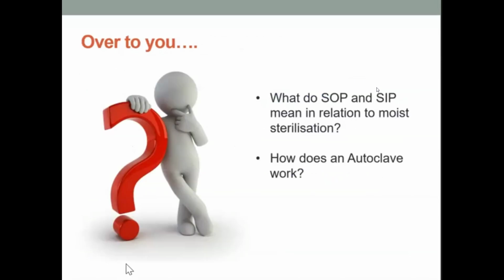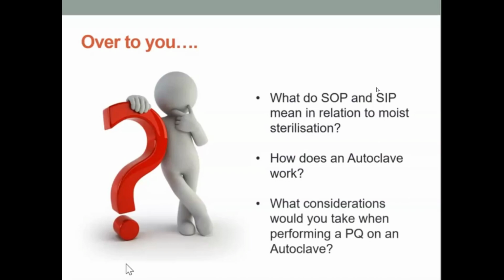Over to you. What do SOP and SIP mean in relation to moist sterilization? How does an autoclave work? What considerations would you take when performing a PQ on an autoclave?